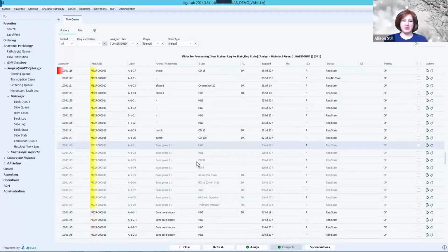Here we're also seeing, if you can tell, these slides are a lighter gray font than the ones above it, right? It's normal black. This is gray. And that's because I have turned on a setting requiring the block queue steps that we performed. And this gray is telling us that the block that these slides belong to is not embedded yet.